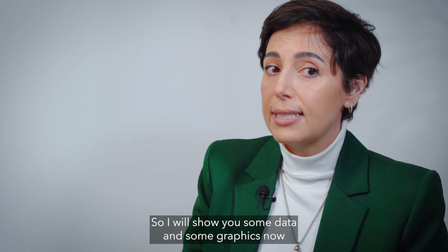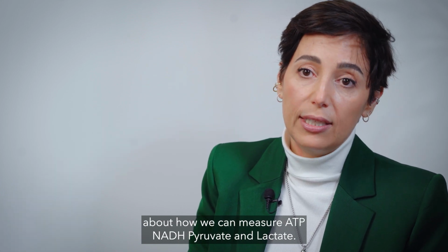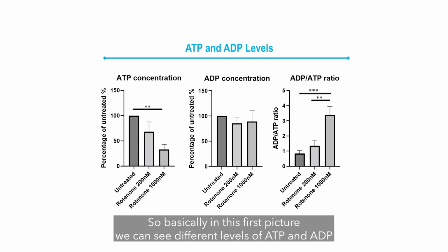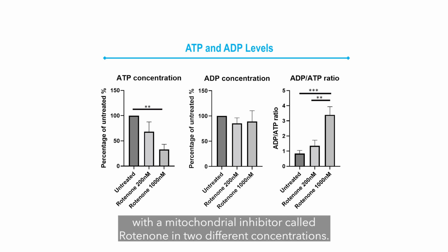So I will show you some data and some graphics now about how we can measure ATP, NADH, pyruvate, and lactate. In this first picture, we can see different levels of ATP and ADP measured in a neuroblastoma cell model that was previously exposed to a mitochondrial inhibitor called rotenone at two different concentrations.